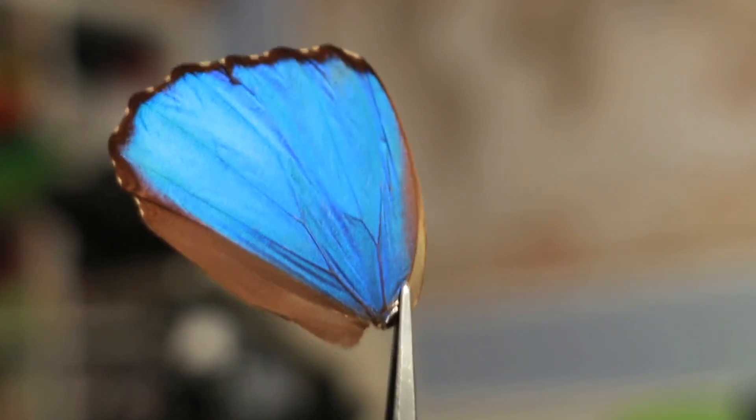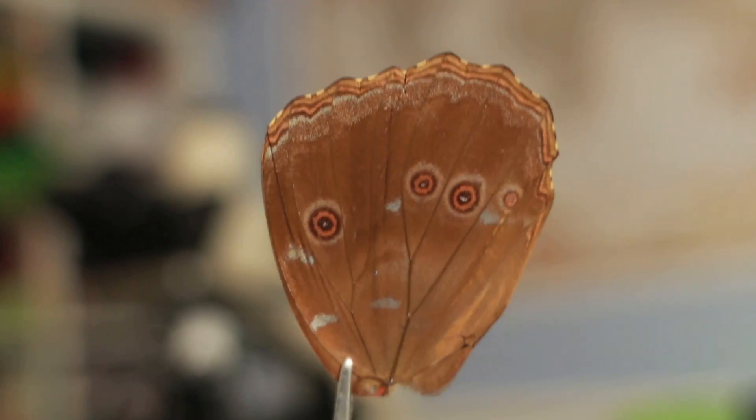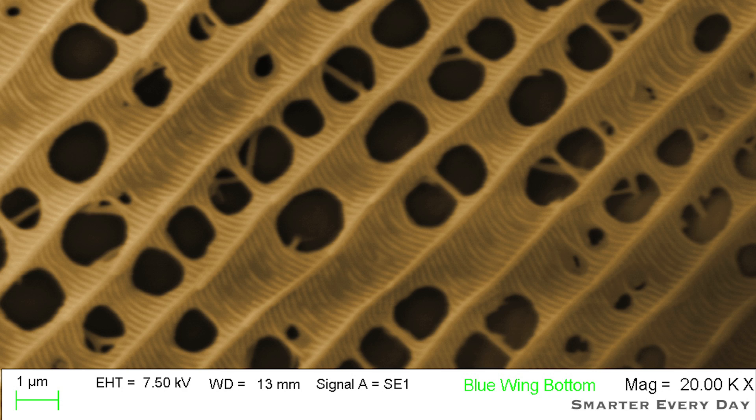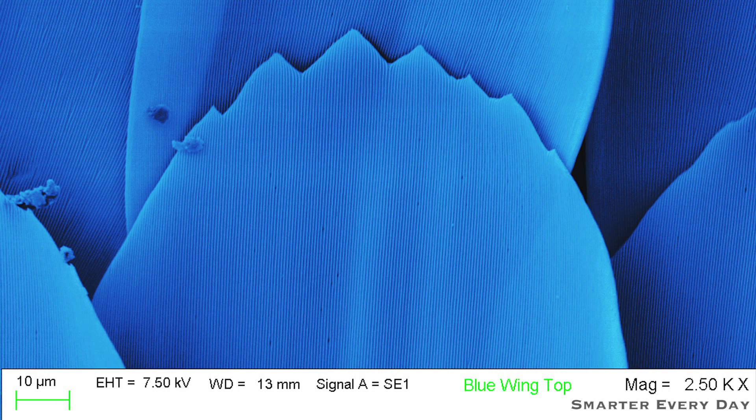Let's look at the morpho. You can see that the tops of the wings are blue, but the bottom has some kind of brownish tan color. If we scan it, we can see that these tan scales have small holes in them, but the blue scales have some kind of ridge in them.